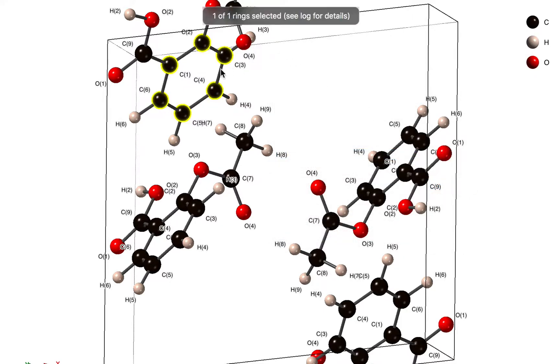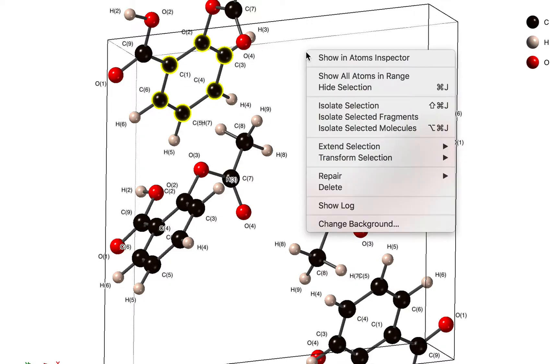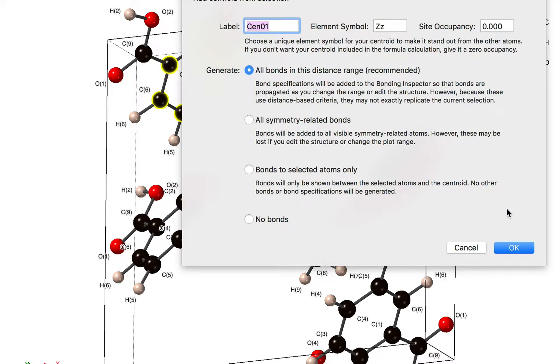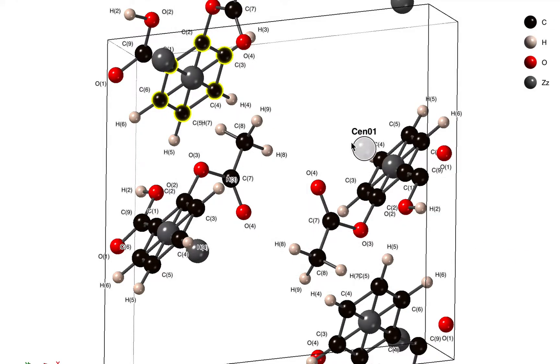Now I want to put a dummy atom right in the center of this ring, and I can do that by using the transform selection add centroid atom command. Now that prompts me for various parameters. Let's just use the default parameters for the moment.